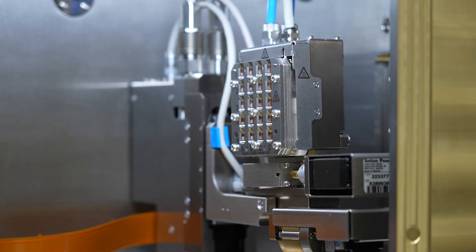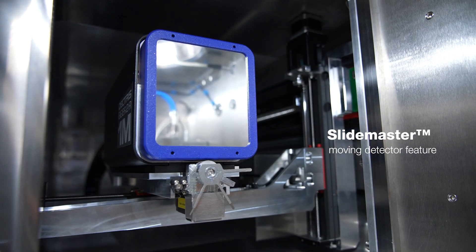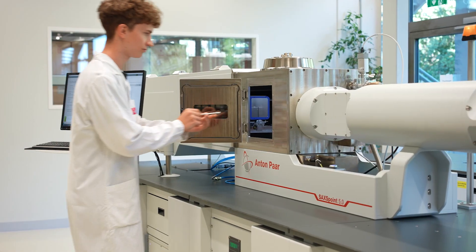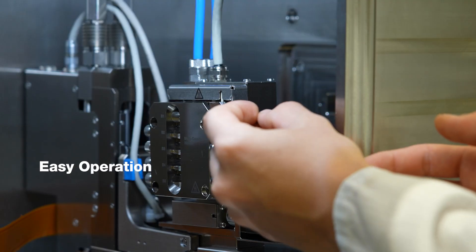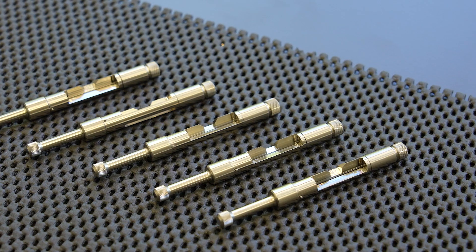Compactness, at the highest SAXS resolution, is in our DNA. SAXSpoint 5.0 offers the best in-class SAXS resolution at an unrivaled system length, empowered by ingenious design and high-precision components.